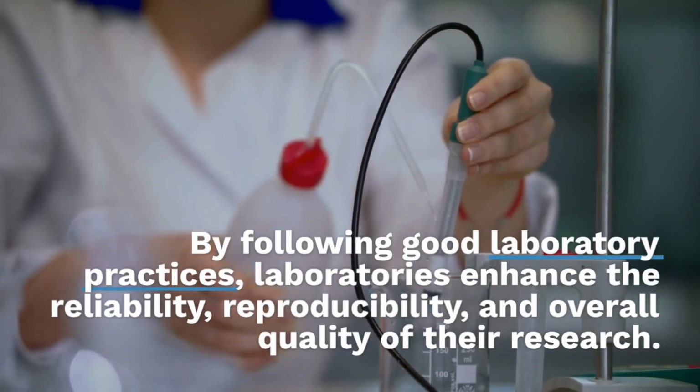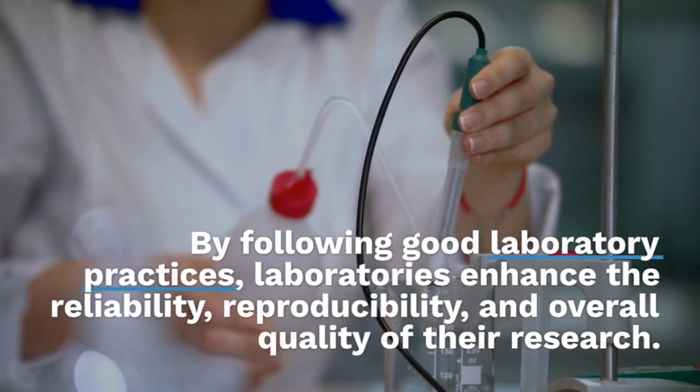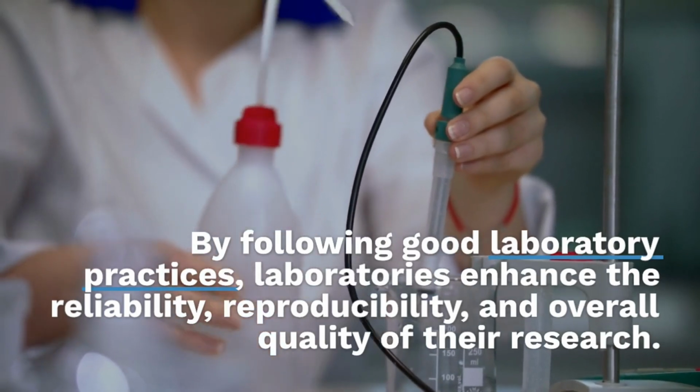By following good laboratory practices, laboratories can enhance the reliability, reproducibility, and overall quality of their research and experimental work.